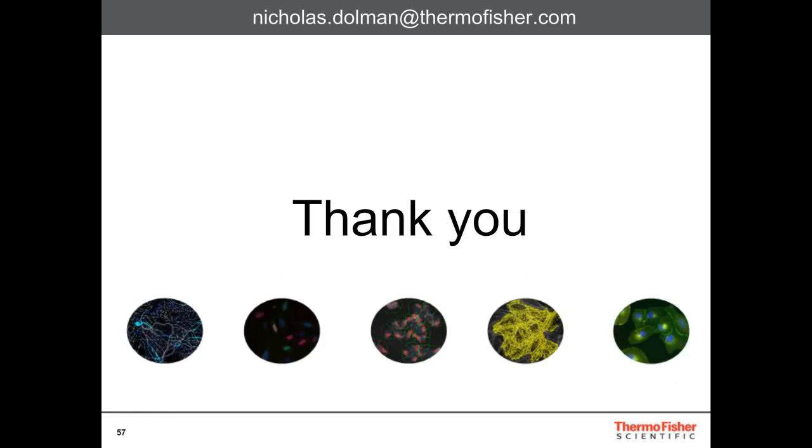Thank you. And our next question is, we often find the center of microtissue dark with confocals. Is this due to the opacity or due to the stains not penetrating into the center of the tissue? It's almost certainly a combination of both of those. So you could be having an issue of the light getting in to excite the fluorophores, the light then exiting and not being scattered, as well as the penetration of the probe.